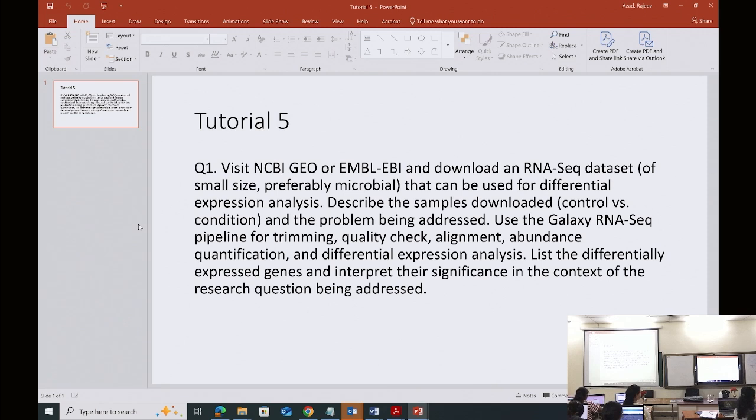There are many software tools that you can use for the same differential expression analysis. Which one would be the most accurate or the best one? Use this one. HISAT is good for alignment. Sometimes people use STAR, Salmon, but then you may have to run on a Unix computer. And this provides the option of DESeq2, which is the most used tool for differential expression analysis. So just try Galaxy. I think it's a good one-stop place.